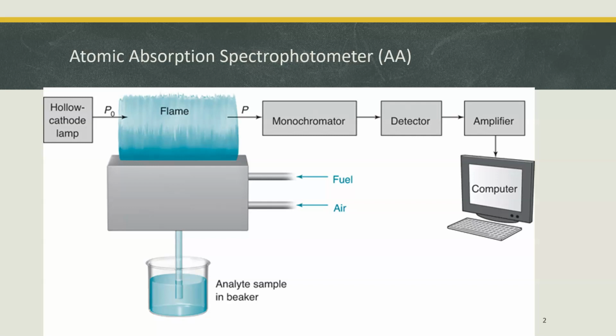The difference is molecular spectrophotometry, the visible spectrophotometry, when you set the wavelength to 510 nanometers or 447 nanometers, and you poured the solution that had a visible color into the cuvette. That was measuring the absorbance of light by a molecule, not just one element, but a molecule. So yeah, we did an iron lab, but it was actually the iron and the O-phenanthroline. And then we did the FeNCS2+. So we measured iron, but it was iron in a compound.